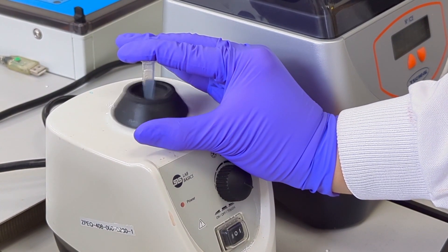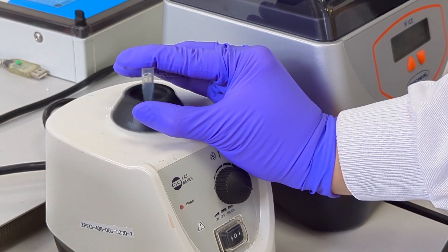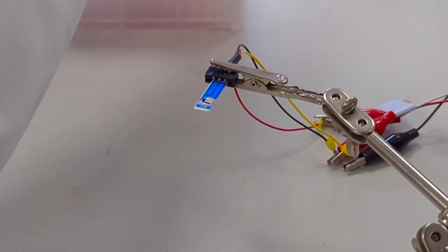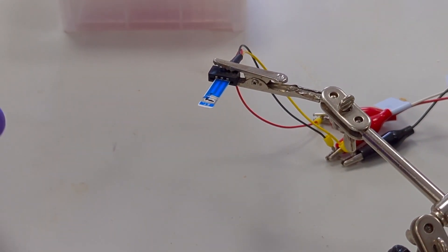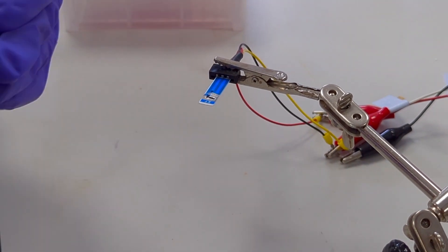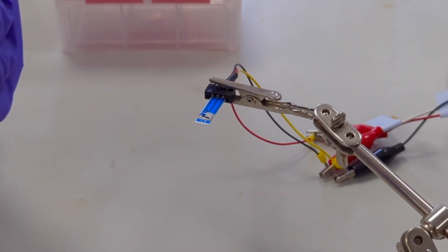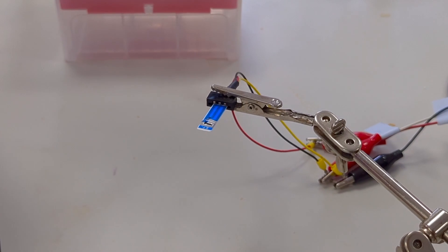Similar to last time, we vortex it to homogenize the solution, and we carefully wick off all the buffer on the sensor surface.